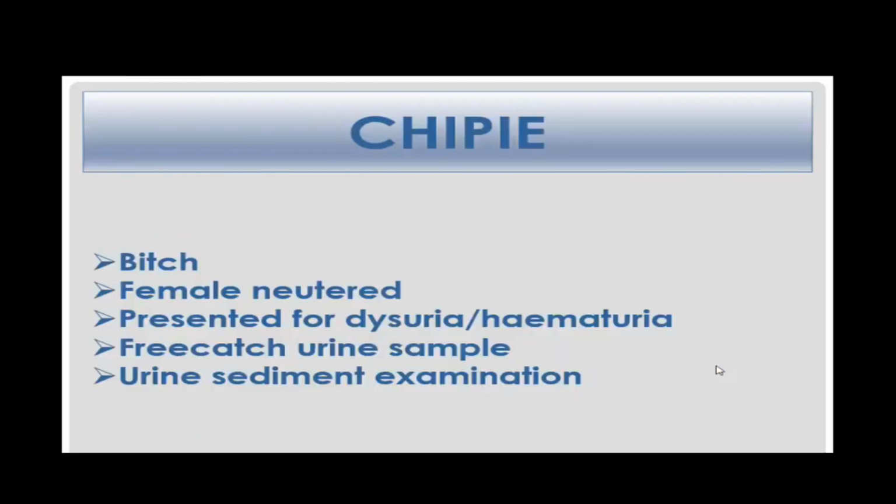So I propose that we apply all that to a clinical case. Sheepy, a female neutered dog that presented for hematuria and dysuria. I will show you a slide of a urine sediment exam of a free catch urine sample. So the first thing is to place yourself in the corner of the slide. I scan through the whole slide at a moderate speed. It can take less than a minute to examine the slide completely.